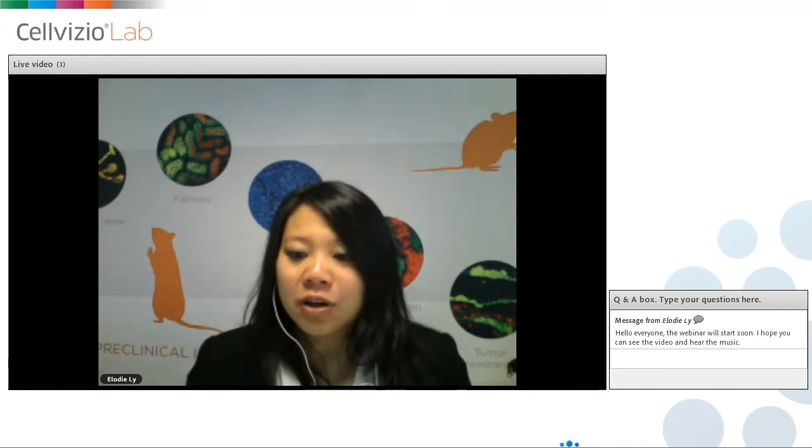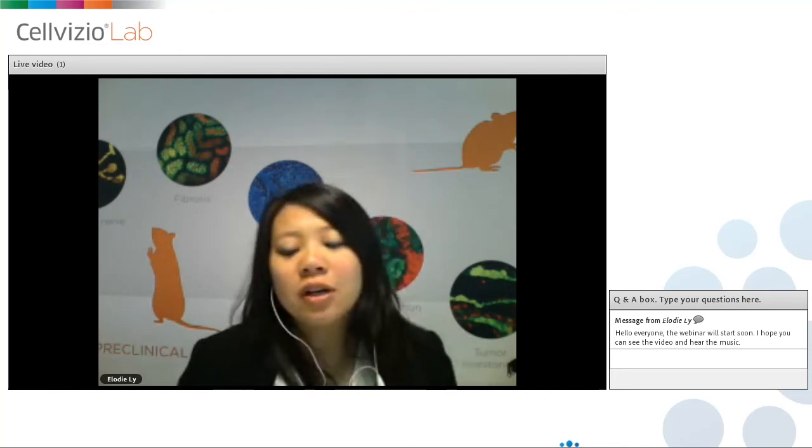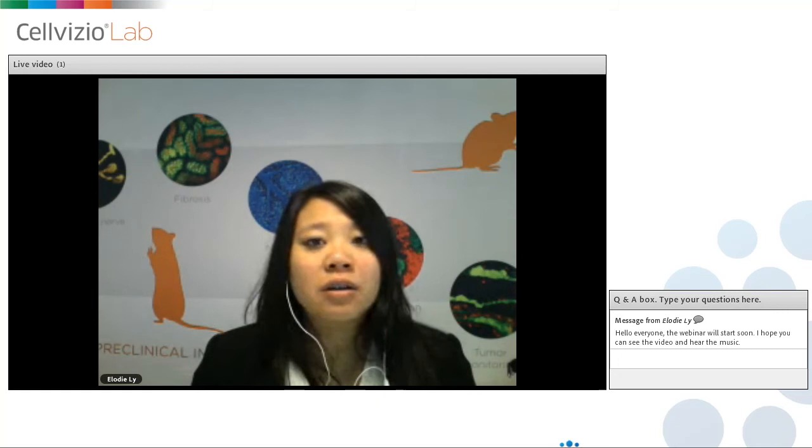So let me check with other questions. I have a question regarding the use of antibodies. We have some examples where antibodies have been used so that you can detect some specific markers.